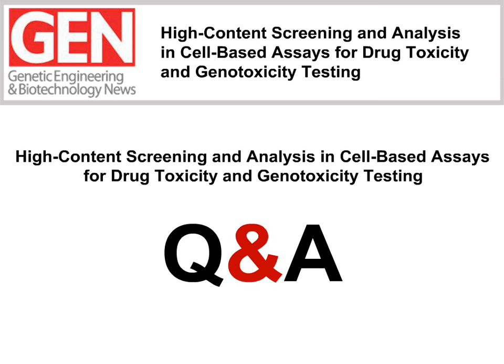Thank you, Giuseppe. Heather, I have a few more questions for you. Do you think the same parameters could be used with other screening cell lines to identify cytotoxic effects? I certainly think the same measurements could be used. Whether the actual numbers were the same is probably unlikely because every cell line is slightly different and you might need to change the size cutoffs. But in principle, I think it could work. We have used it with a few other cell lines that haven't made it into publication yet, so I think it's distinctly possible.